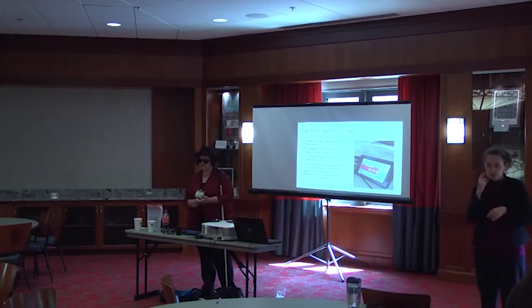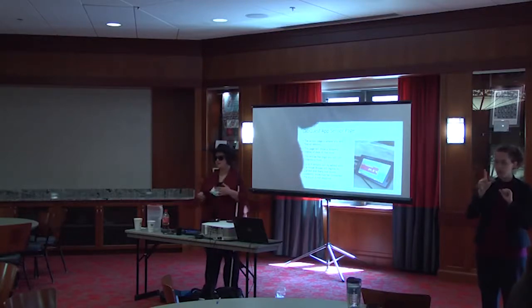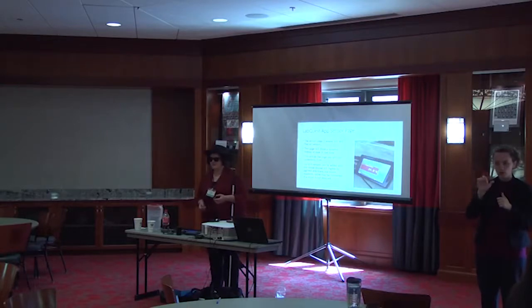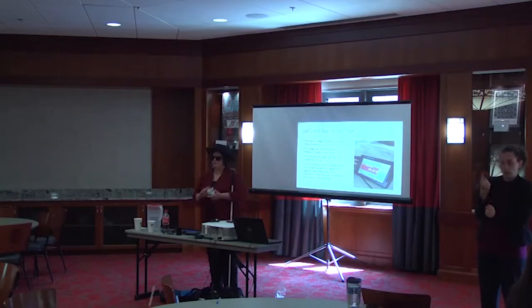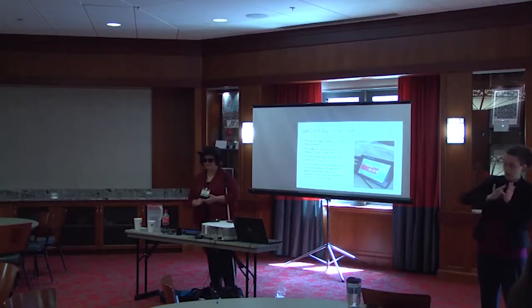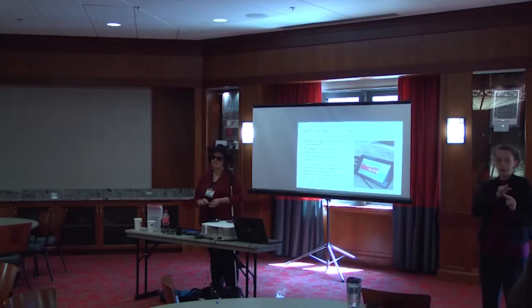Check menu item live tone only during collection, checked. So this tone is the only tone during that collection plays. Not checked. It'll go up when the temperature goes up and down when the temperature goes down. And then it slowly gets more pleasant to listen to there.